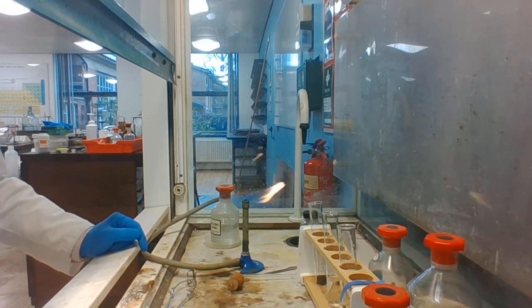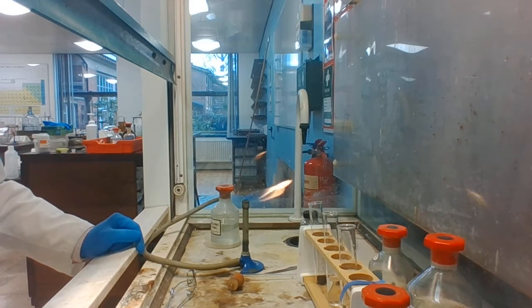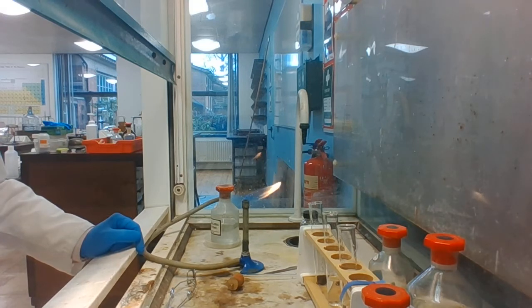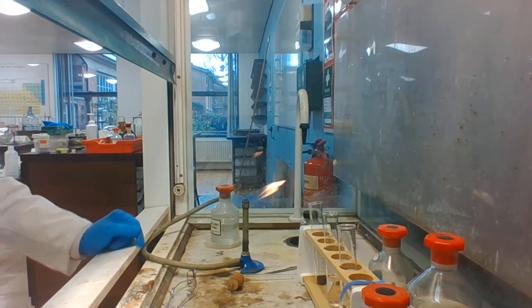In this clip, I'm going to try and demonstrate the displacement of a less reactive halogen by a more reactive halogen. I'm going to generate chlorine gas by reacting hydrochloric acid with manganese dioxide. Then I'm going to bubble the chlorine gas through potassium bromide solution and potassium iodide solution.